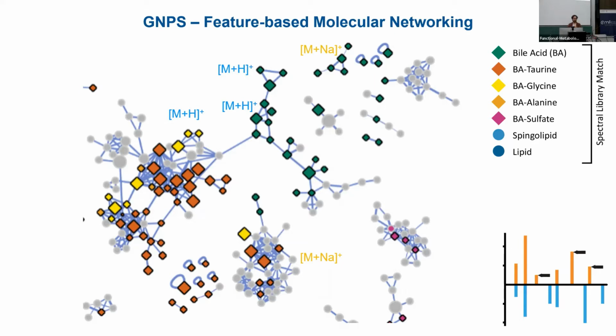So as this is so important, did anyone have some questions towards molecular networking, modified cosine similarity, library matching?